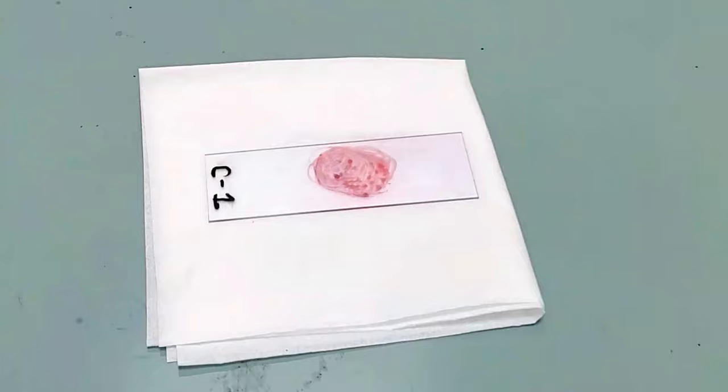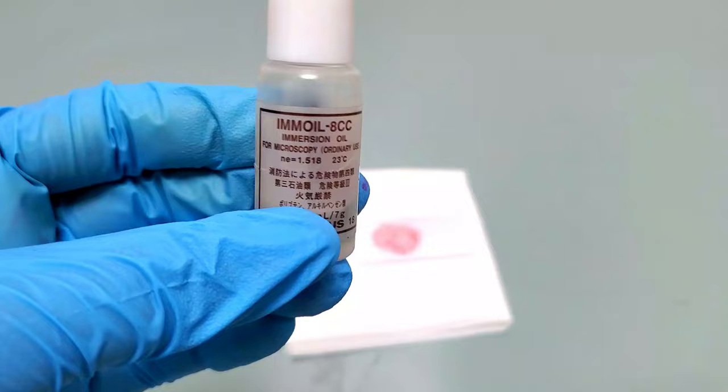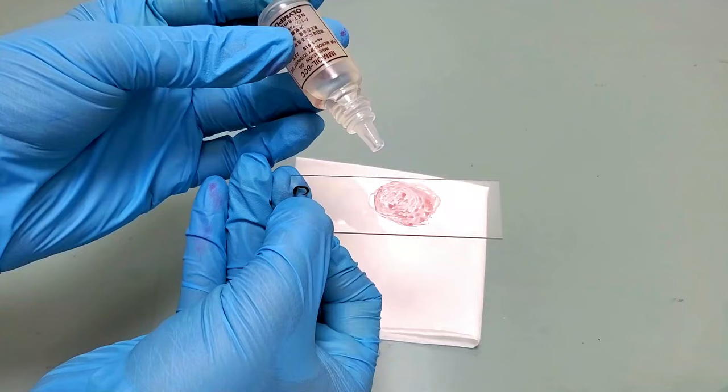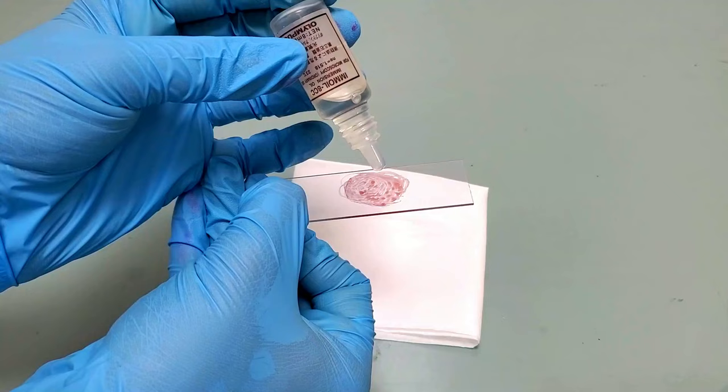In this step, we will observe the stained bacterial cells on the glass slide under a bright field microscope. This is immersion oil, which will be used for the observation of bacteria at 100-time magnification under the microscope. Place a drop of the immersion oil on the smear.